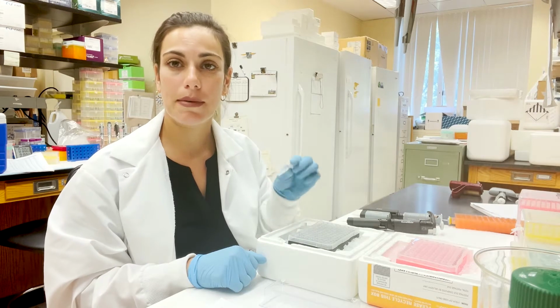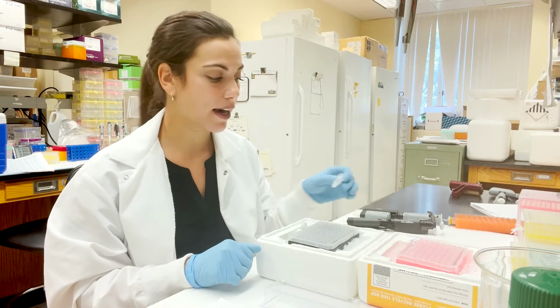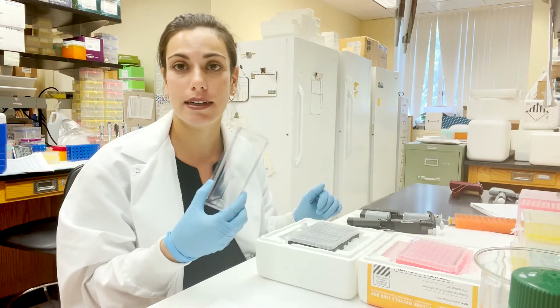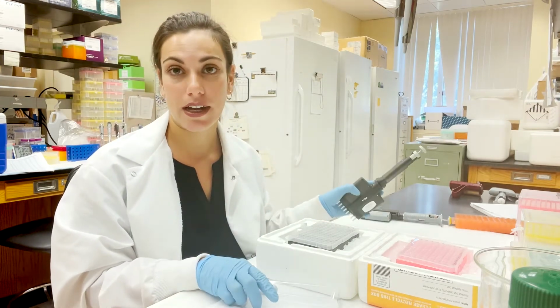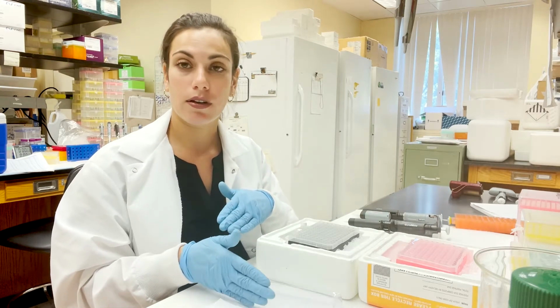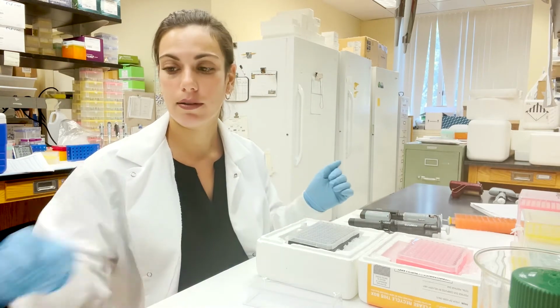I've calculated my master mix so that way I have enough for every single well in addition to a little bit extra so I can put it into the sterile basin and then use a multi-channel pipette. So I'll mix it up now and then add the amount, a total of 26 microliters, to every single well.